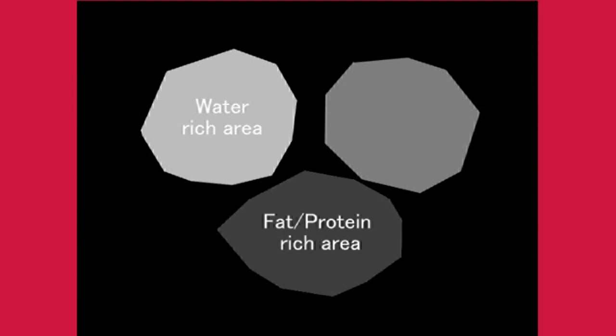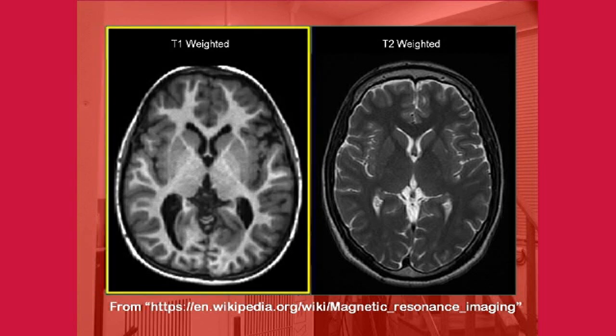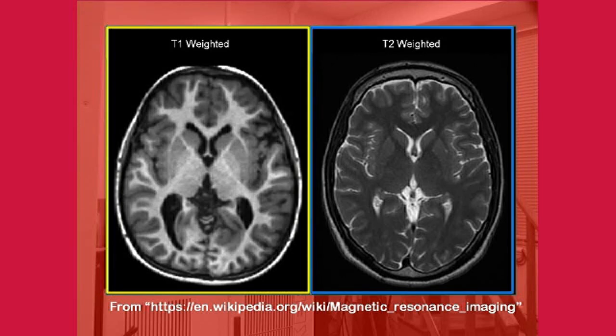As described above, various images can be obtained by combining the T1 weighted image, in which high molecular weight parts such as lipids, melanin, and proteins appear white, and the T2 weighted image of the spin-spin relaxation enhanced imaging method, in which the water-rich part appears white. We can get information in the living body.